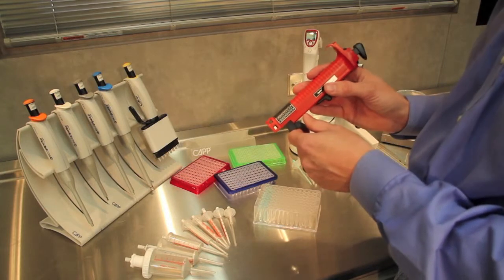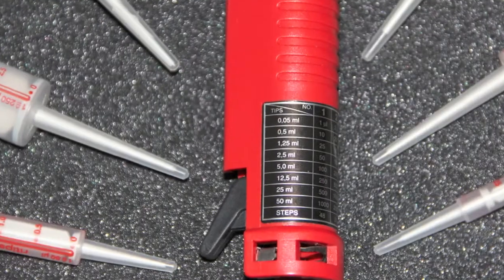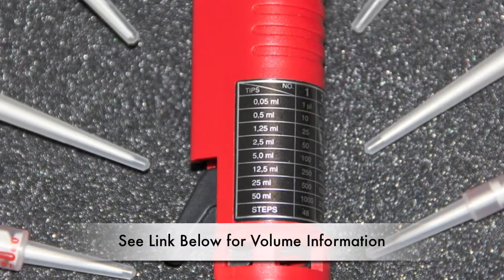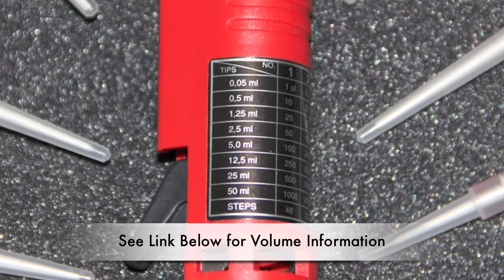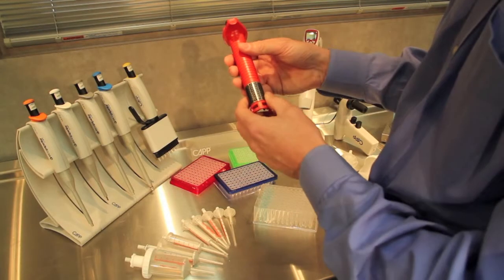So on this unit there is a chart that tells you the different dispensing volumes you get with each one of the syringes and with which setting on the unit itself.